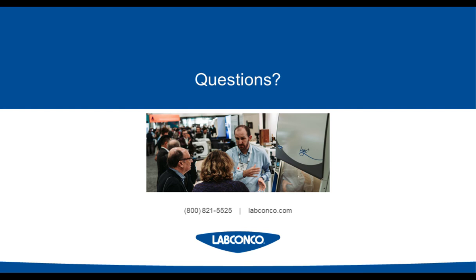Thank you. Our next question is, my BSC hasn't been certified in a long time. Who do I contact for this service, and how much will it cost?